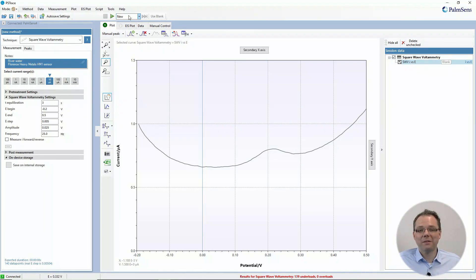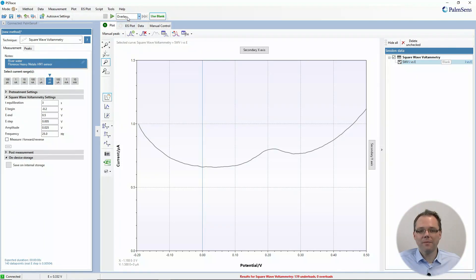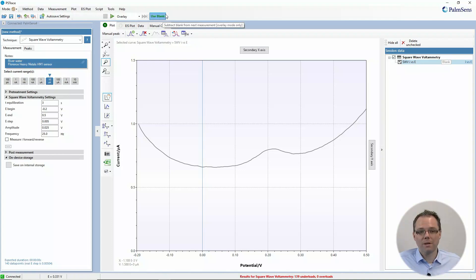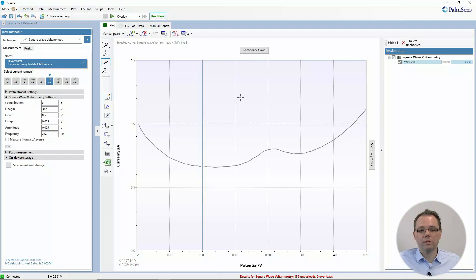You can toggle it off if you don't want to use the blank for a certain measurement, but if it has a frame, it's toggled on and you can use the blank.